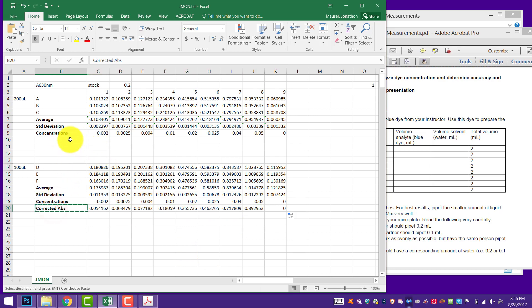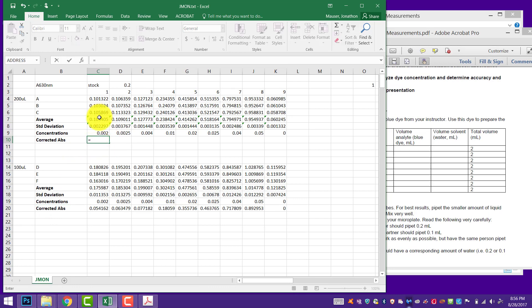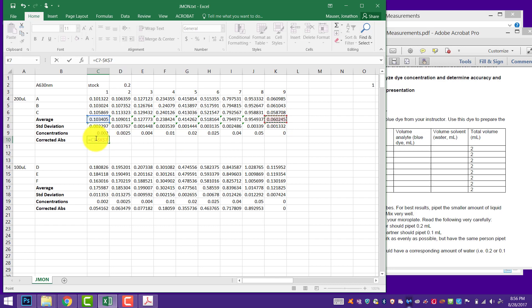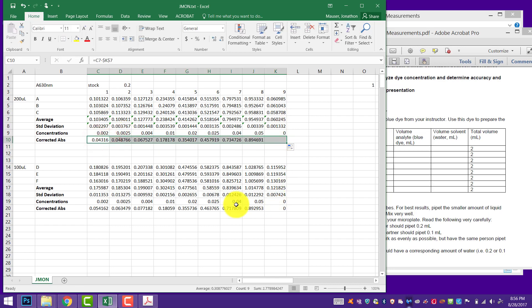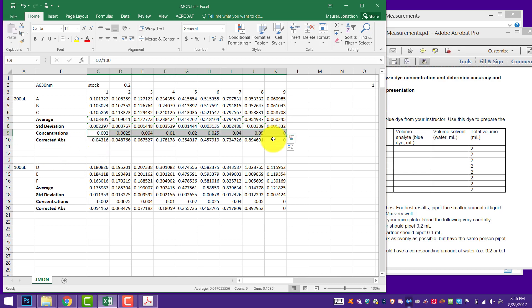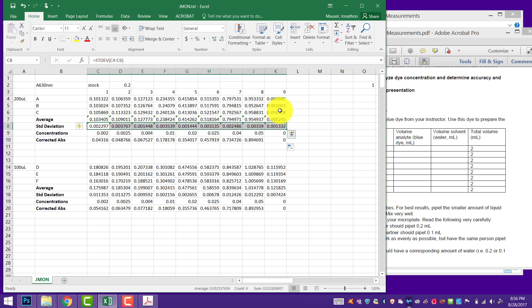I'm going to do the same thing for my other set. I'll grab my average, subtract my blank absorbance, hold that constant by hitting F4 — putting dollar signs in front of the K and the 7 — and as I drag across, we'll have the correct absorbances for the 100 microliter set. So now we have X's and Y's along with our standard deviations, and that's what we need to do our plotting.